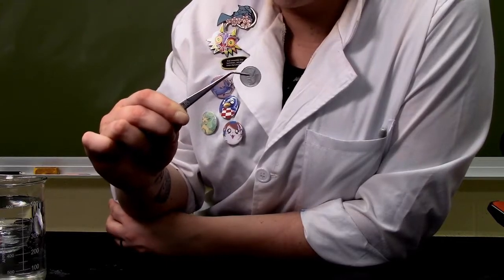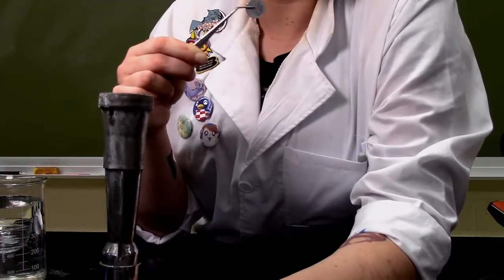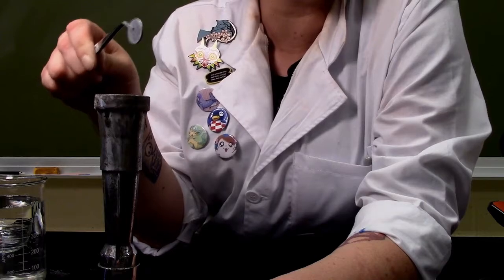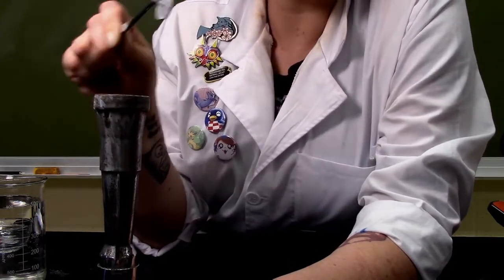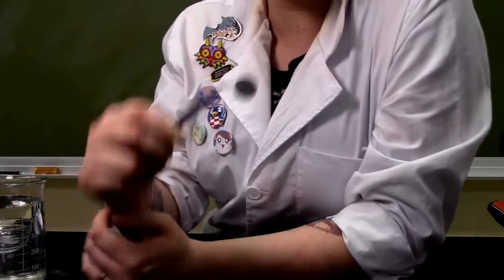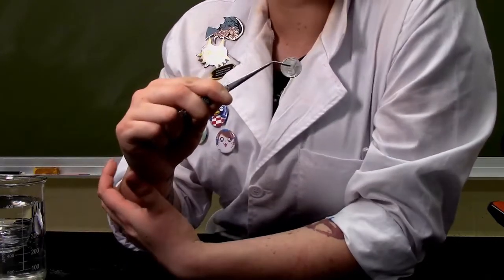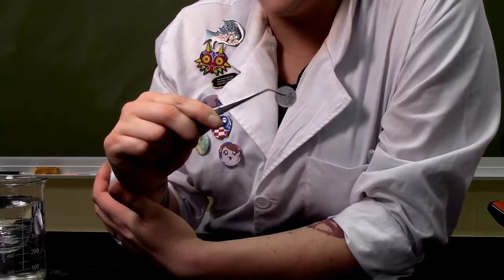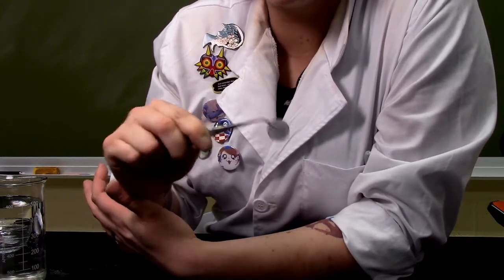So what's happening? Well, I'm gonna take this Bunsen burner, turn it on, and heat this zinc-coated penny until it's really, really hot. That's going to cause the zinc to chemically react and form a brass alloy on top of the penny. Now, if you've seen a brass instrument, then you know it looks pretty gold. So we're not really making gold, but to a passerby, it looks pretty much like it.